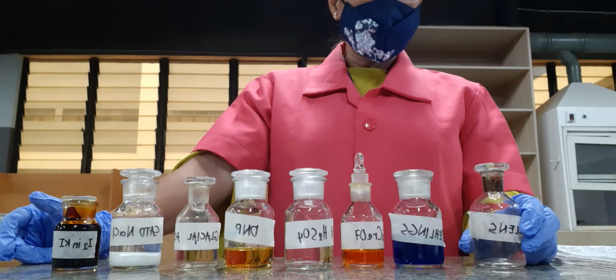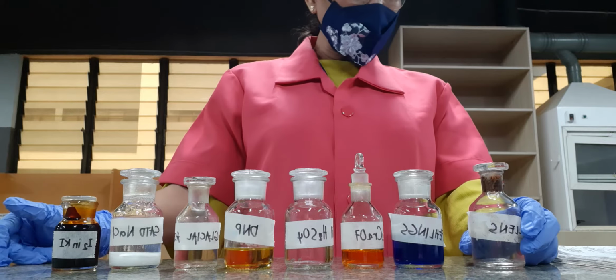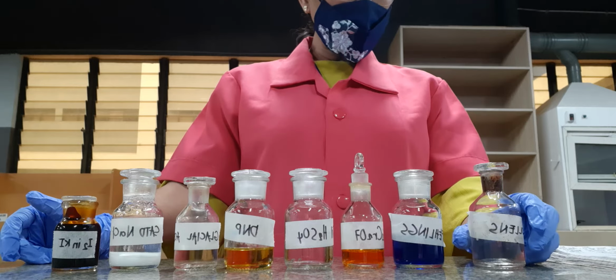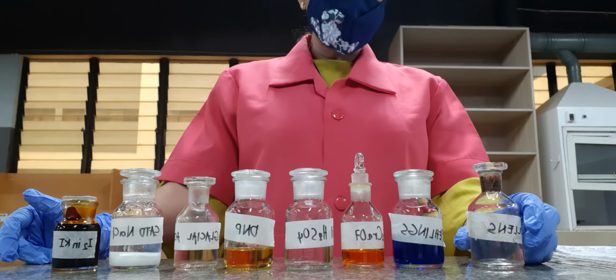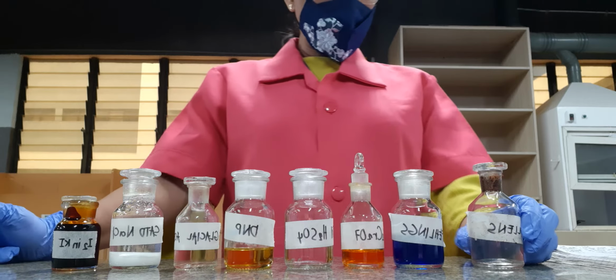deposition of metallic silver out of the reaction with our aldehydes. Even benzaldehyde will form metallic silver as our reduced product.